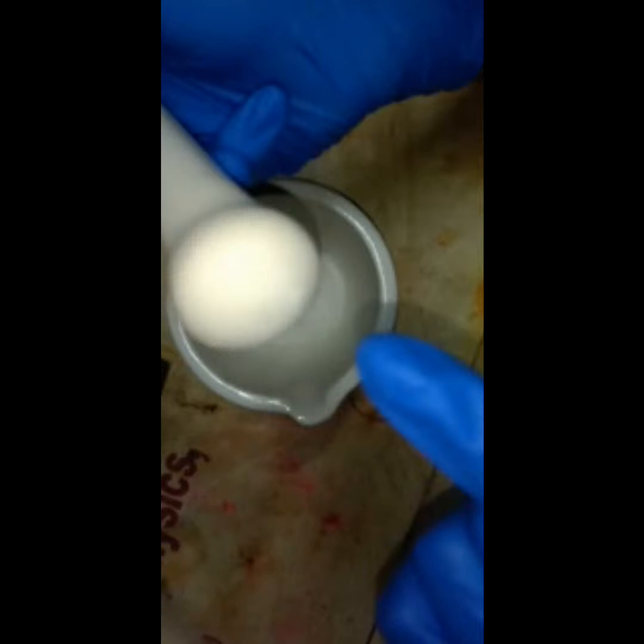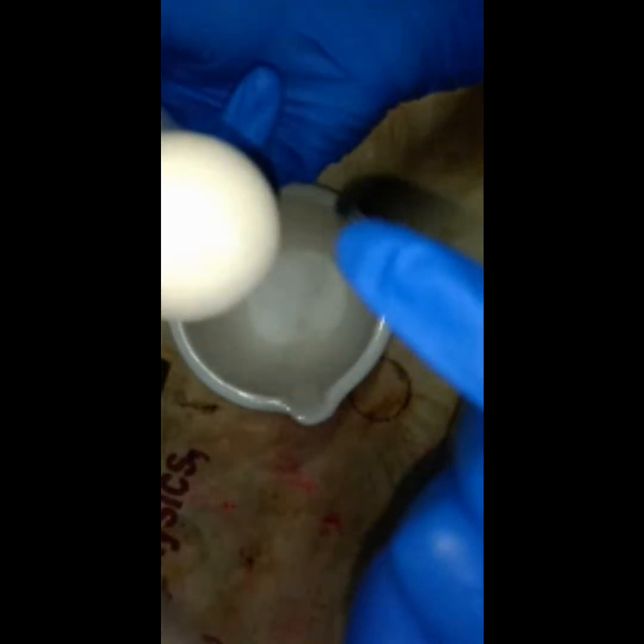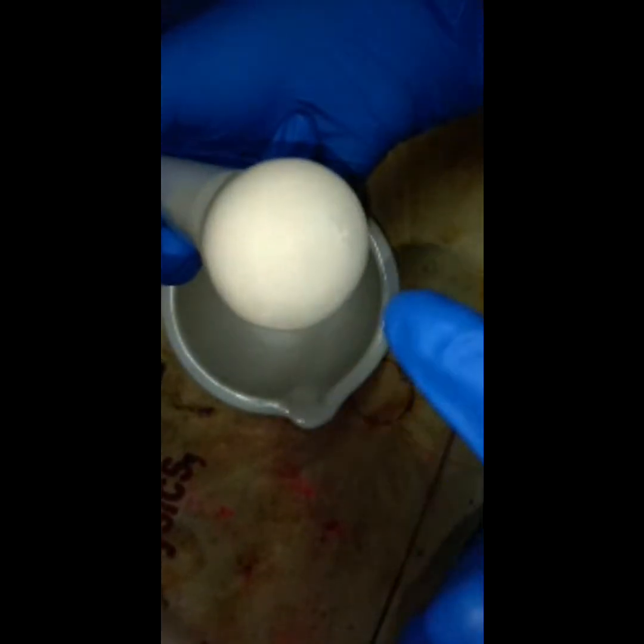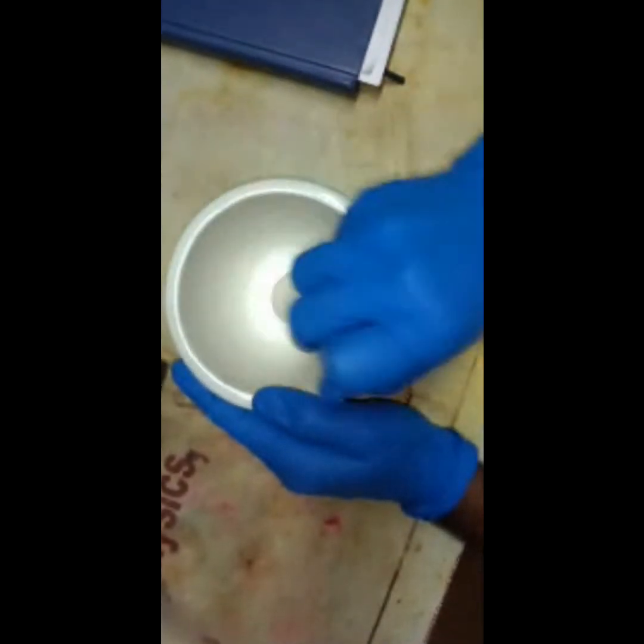You can observe the particle size and the overlap on the envelope. You can see the nanoparticles as little dots on the screen. You can see clearly, or maybe not that clearly, but you can ask anything in the comment section.